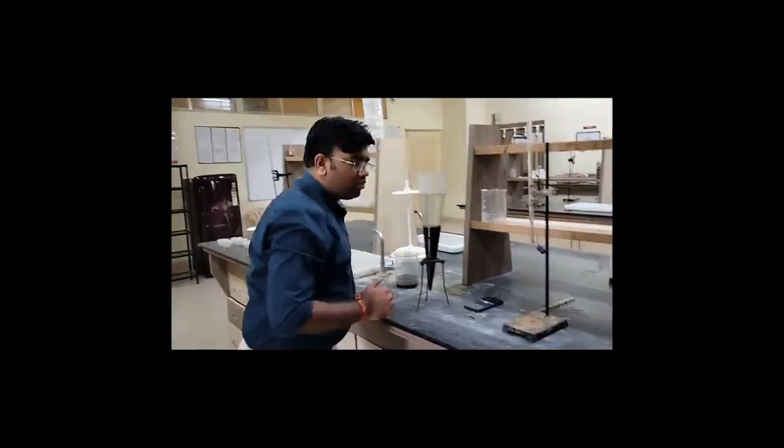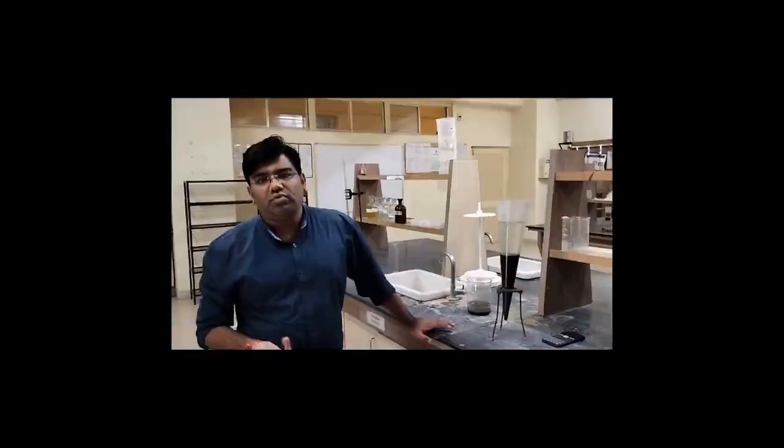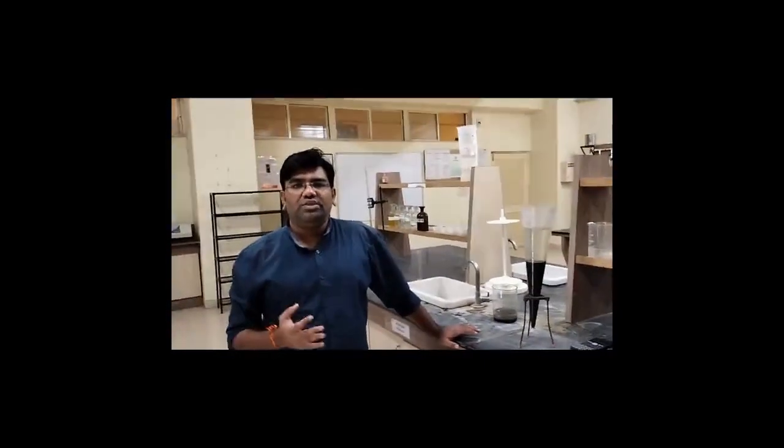340.74. Now the next thing we require in the formula for finding out the SVI is the MLSS, right? So how are we going to find out MLSS? MLSS means mixed liquor suspended solids. The formula we have seen in the solids, how we can find out the total suspended solids, is the total solids minus the total dissolved solids. So here we are going to do the same.